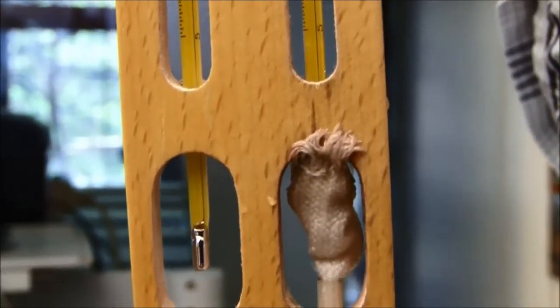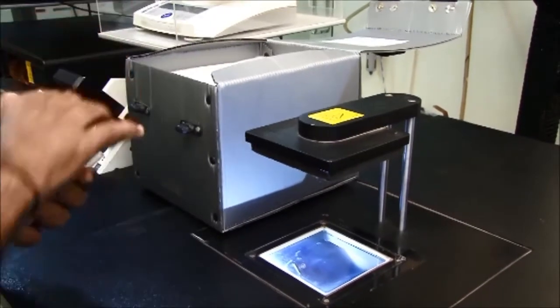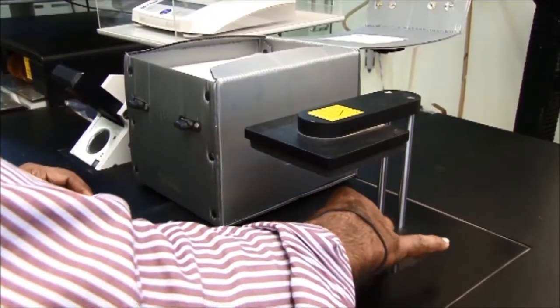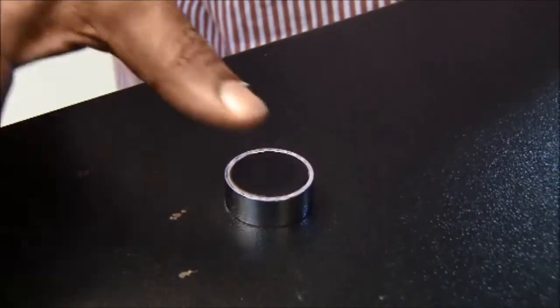Cotton round test member of ICA Bremen Germany and Sikot India. We have a Premier HFT-9000 machine which uses USDA calibration cotton to assure international standards of precision and accuracy.